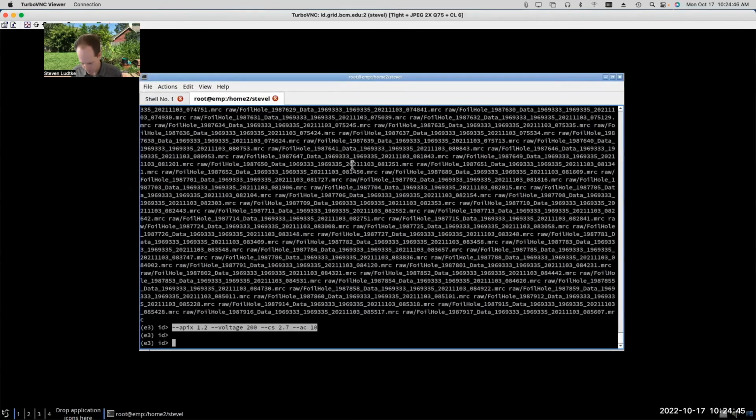So what I have here is a real data set that was collected on the Glacios. This was collected back before we'd corrected a couple of detector issues, and there were some issues with some of the movie alignment and stuff like this. So the images that we're going to be seeing here are more like images that we would have collected on film 15 or 20 years ago, rather than what you'd see now on a modern detector with movie mode correction and stuff like that. But still, it's the sort of thing that you might still see, and we can look at some of the features of some of these images.